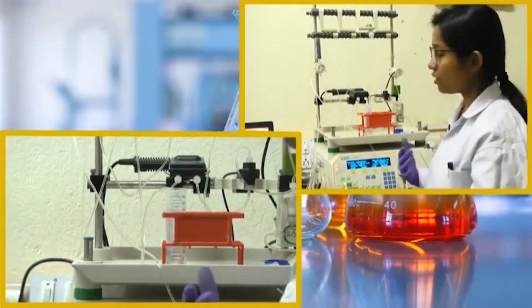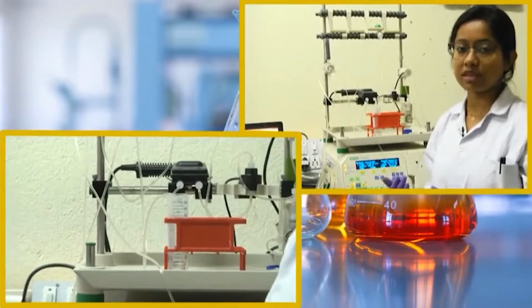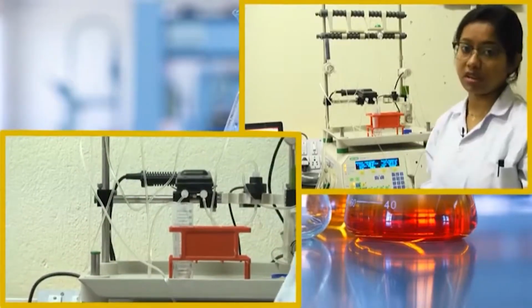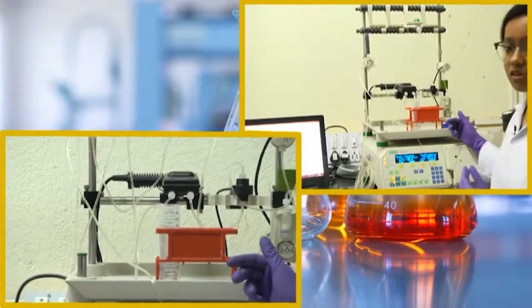Buffer B, which has a higher amount of imidazole, will compete with our protein of interest, and it will displace our protein from the column, and then in the elution fraction our protein will come out. Right now, what will happen is other proteins will come out from this column, which is also called wash.